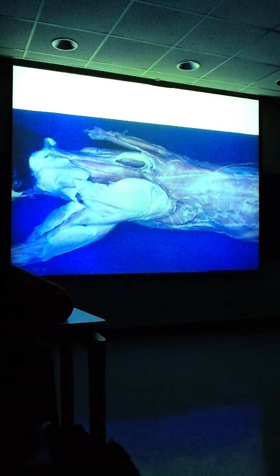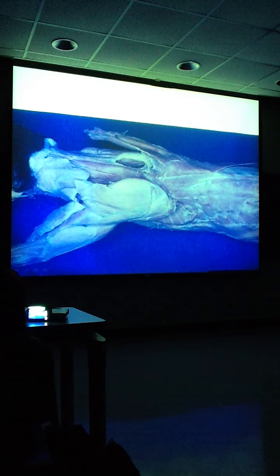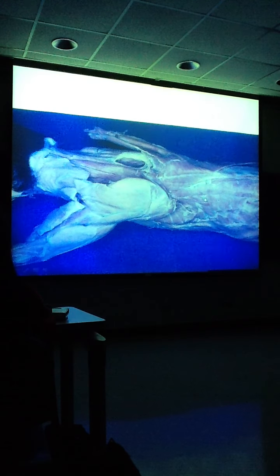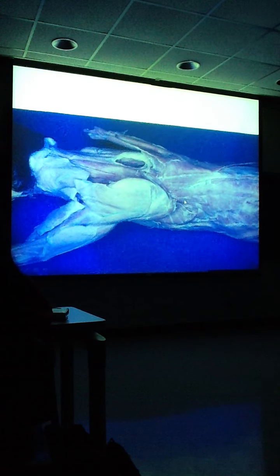If this is longissimus, Mr. Gilmore, there's one right here, and he hides under these muscles. This one that hides under this muscle, Mr. Gilmore. If I reflect this back, I'm going to see this muscle right here. His name is iliocostalis. I can't see him because he hides. Mr. Gilmore, there's this another muscle right here. What's his name? Spinalis dorsi.